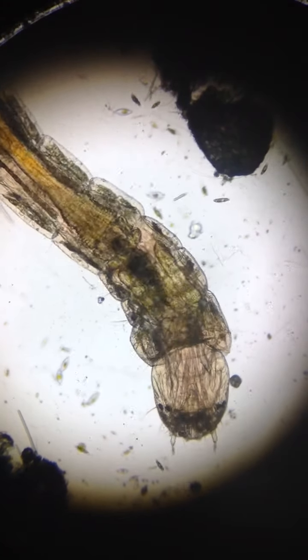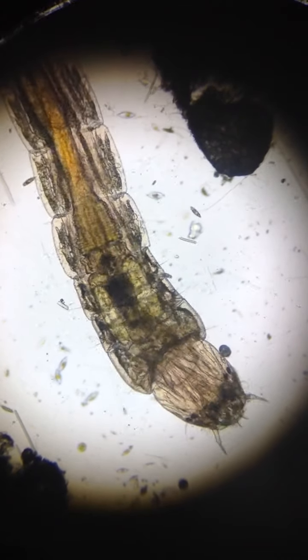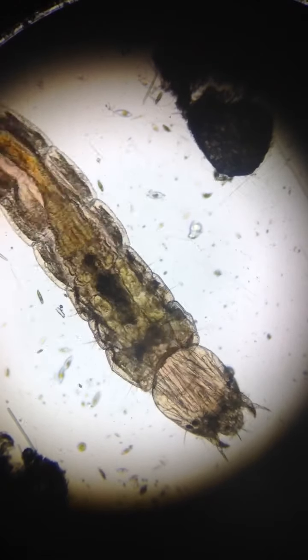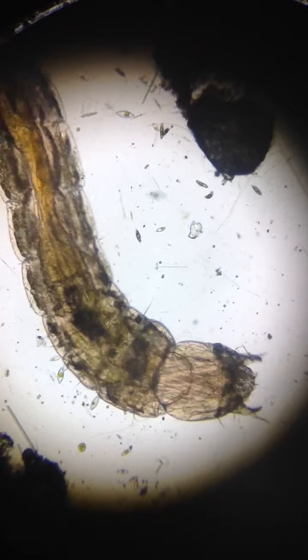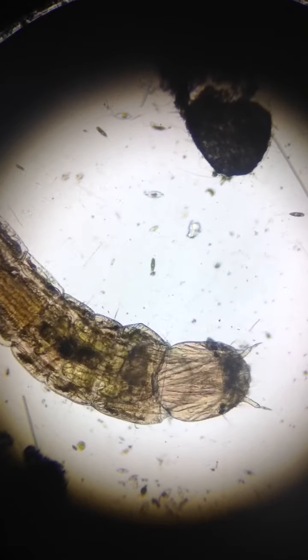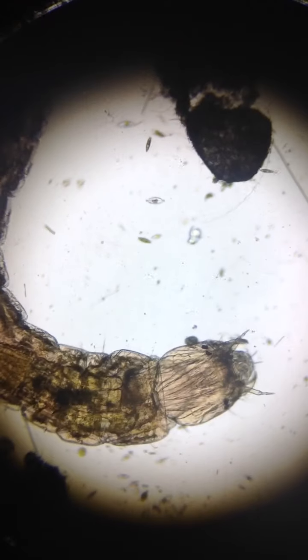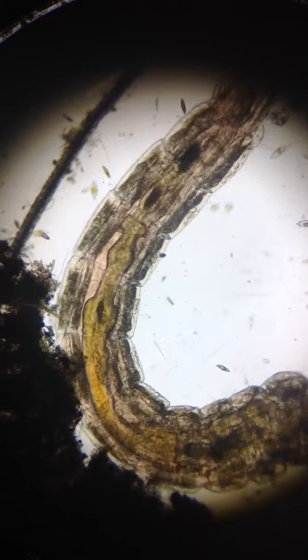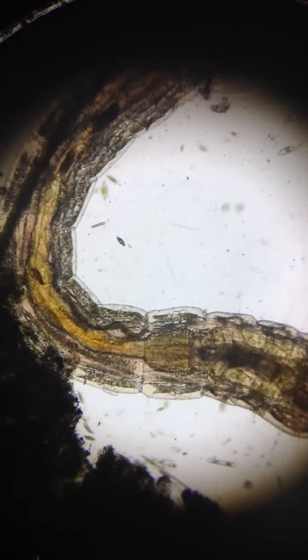Something like this. So what we're going to do now is convert these millimeters also into micrometers. And we're going to divide the horizontal resolution, this one here, by 13.75, which is determined just on the other side.